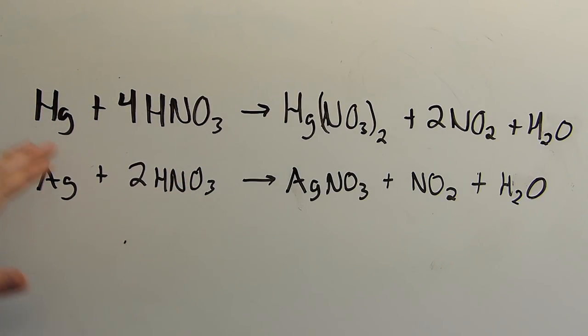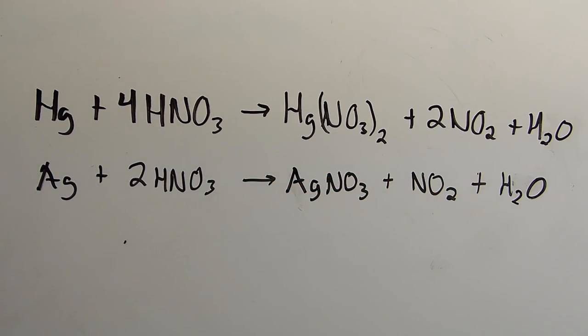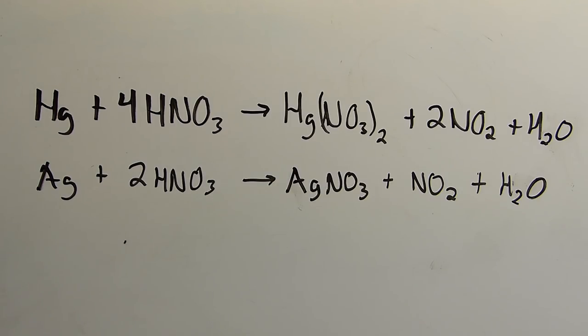I'll calculate how much nitric acid I need for the silver and mercury I'll be using and we'll just heat it up. The heat will also help drive these gases out of solution by reducing their solubility and that'll speed everything up. Now I should also mention that the excess nitric acid in solution will have no effect on producing the tetraiodomercurate, so we can go ahead and not worry about how much excess nitric acid we've used.